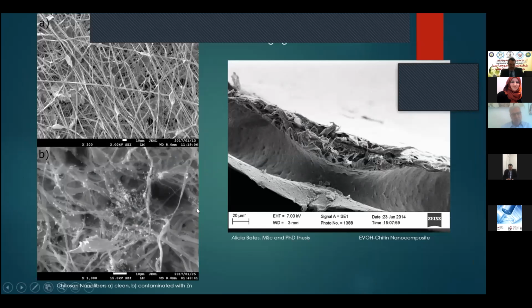So this is just a picture of my previous work from my master's and my PhD thesis. On the top left, where it's marked A, these are fibers. Now, I wanted to call them nanofibers, but they are definitely not nanoscale, and with the help of SEM, I was actually able to establish that. So this was electrospinning gone wrong, unfortunately. These fibers were a bit beaded and agglomerated, but that was useful for me to adjust my electrospinning method and then improve on the electrospinning and the nanofibers.